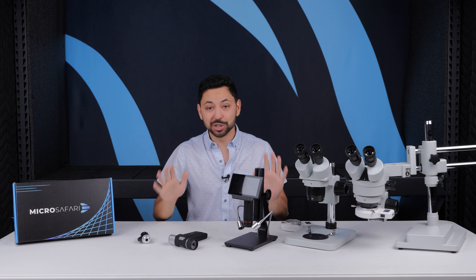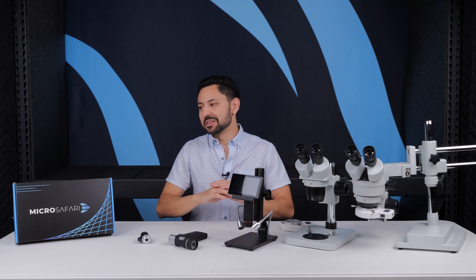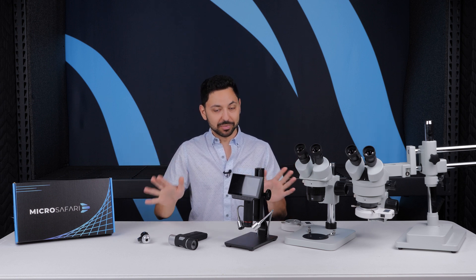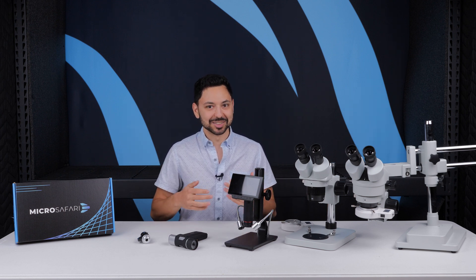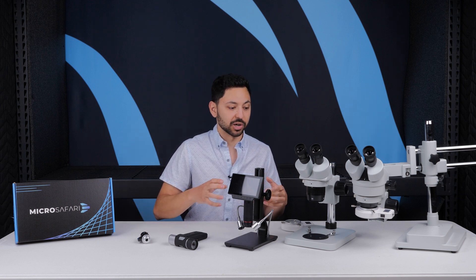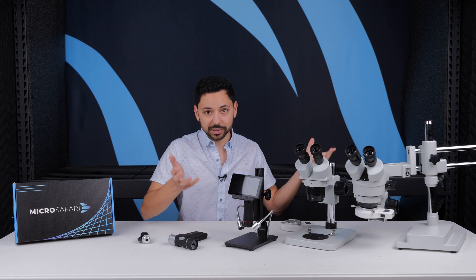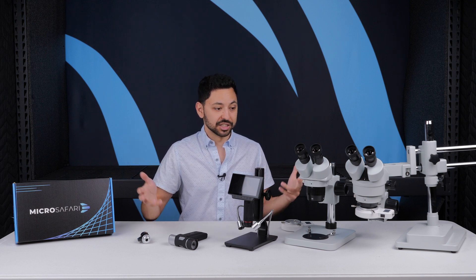Piece of advice number three: don't put too much weight on brand names for microscopes. Whether it's Amscope, Euromax, or Swift, the dirty secret is that they're all just buying these microscopes from the same suppliers from China, at least at this kind of price range. They do have huge catalogs, and I could be incorrect on some, but the most popular sellers I know are the same as the ones we're sourcing from. So don't worry about it. I would say worry more about the big-picture feature sets that you get out of the microscopes. If something looks too cheap to be true and to be good, then it probably is. Generally I don't see a lot of rip-off companies selling way overpriced stuff—it's pretty competitive for what you're getting, at least for the most popular brands.